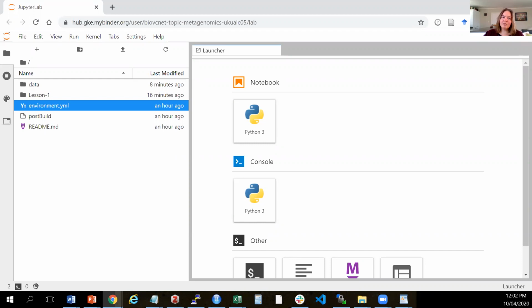One of the first things that you'll want to do when you receive your next generation sequencing data is to have a look at it. And so today, as part of the Bioinformatics Virtual Coordination Network, I'm going to take you through a short tutorial on how to do that.